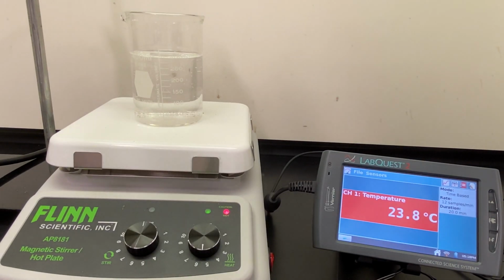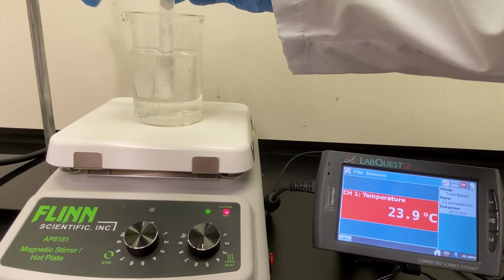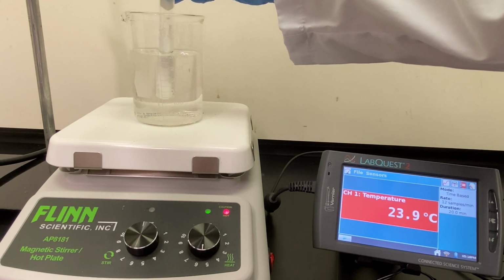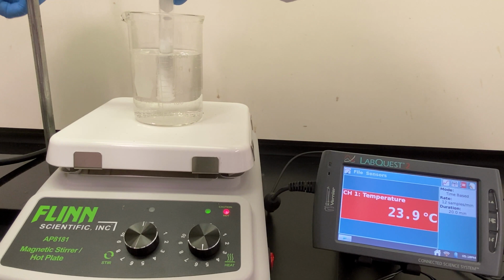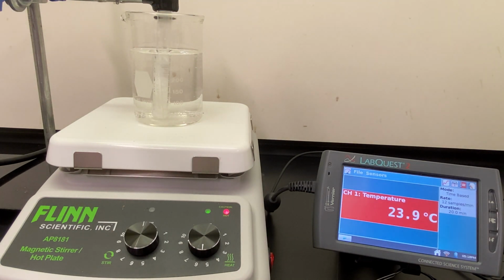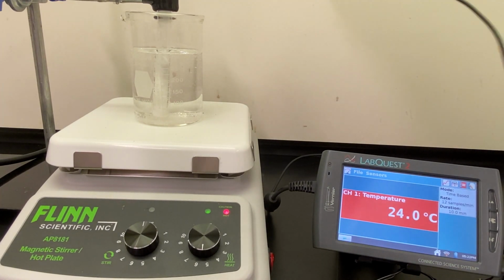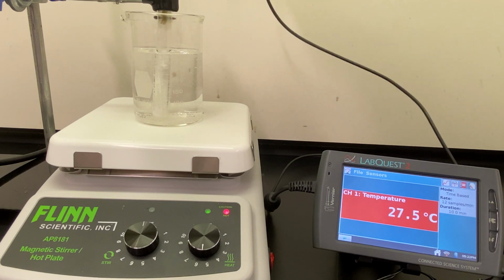Add the test tube and lauric acid to the container of water that has been heated. Attach the test tube to a utility clamp to hold it in place. Add the temperature probe to the test tube and lauric acid in order to monitor the temperature as the lauric acid melts.